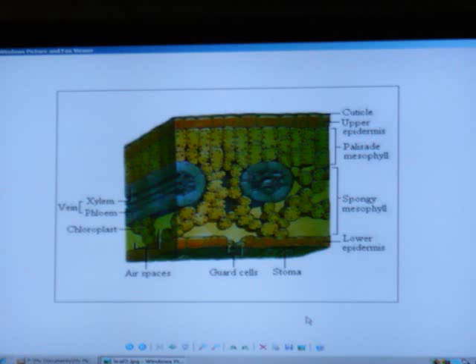If you look right here, and you can't see it, there's a fine waxy covering. It's just wax. And that wax is called the cuticle. Now, a magnolia leaf has a real thick one, and other leaves, like a leaf off a mimosa tree, are real delicate. Trees that are designed to stay in the sun all the time have thick cuticles so you don't lose water. If you're a shade tree, you have thin cuticles because you're shaded.